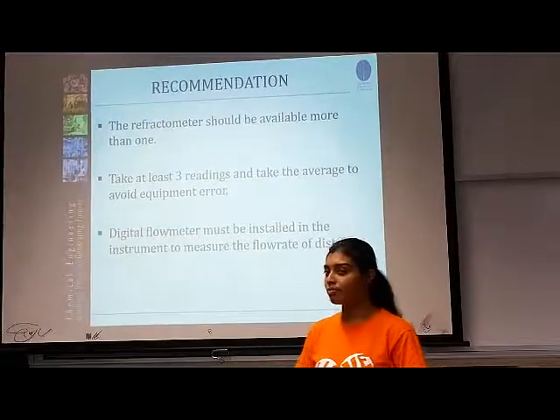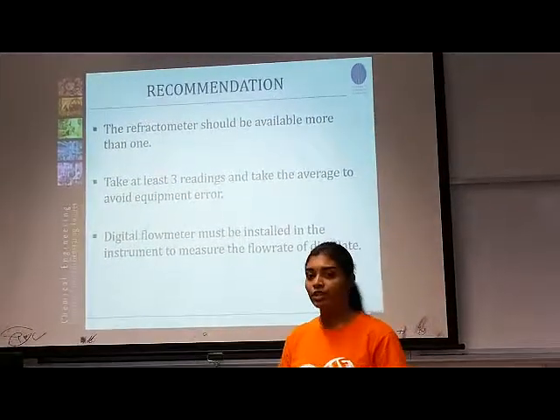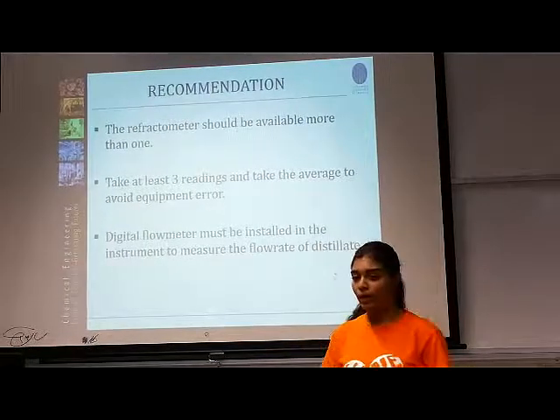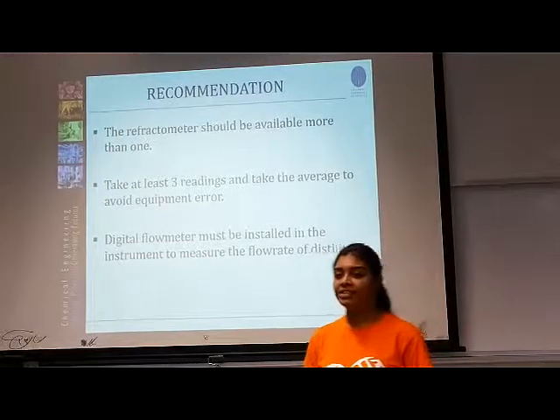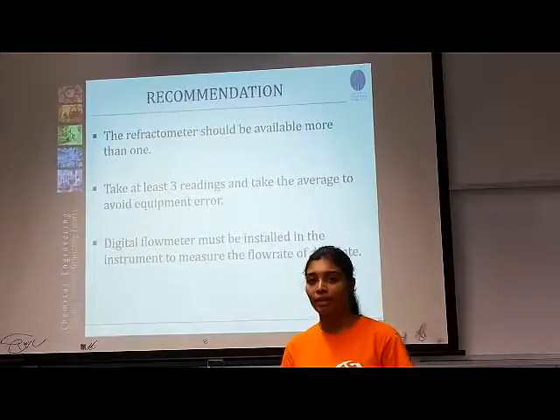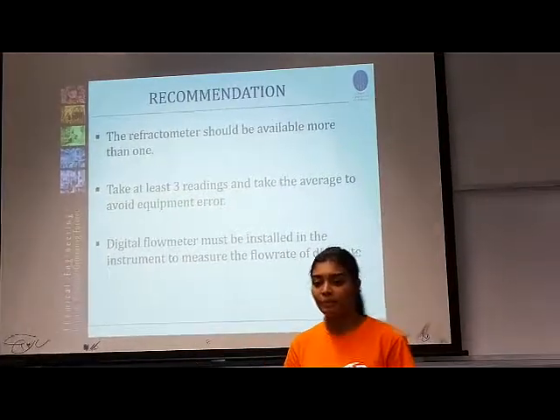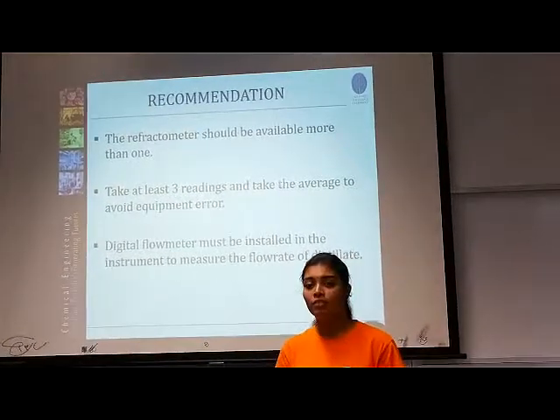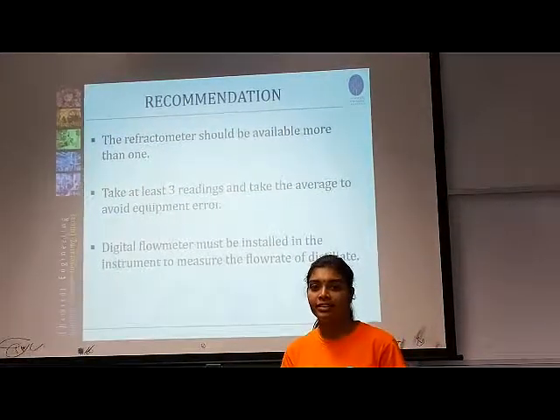Let me give some recommendations to avoid the errors in this experiment. Firstly, more than one refractometer should be available. Moreover, take at least 3 readings and take the average to avoid equipment error. And the average taken of distillate.